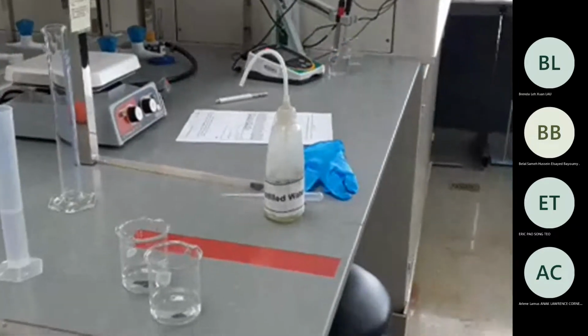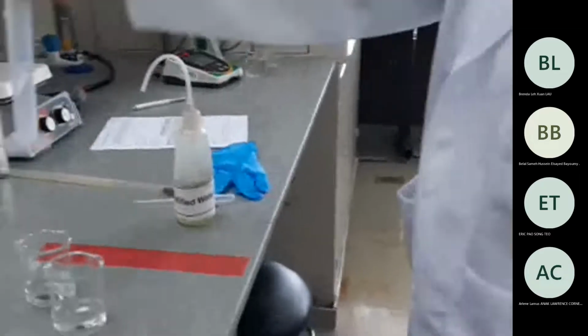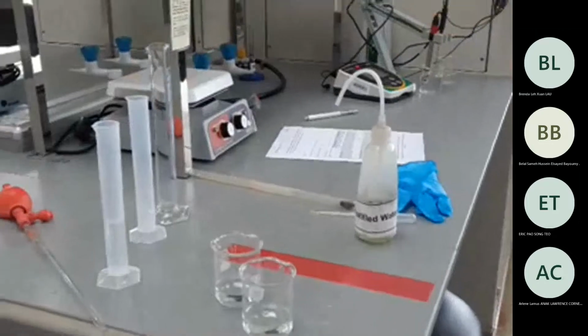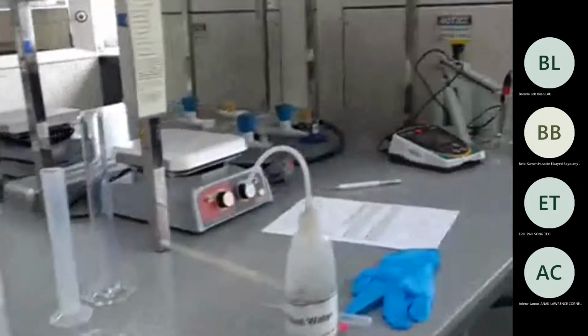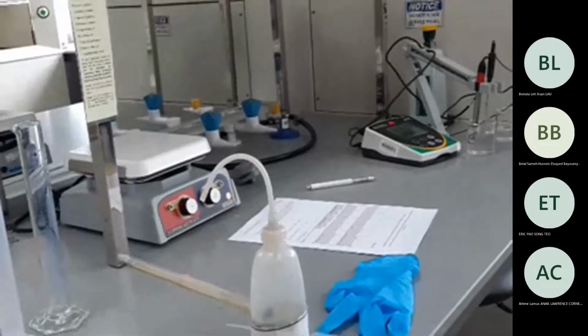Take the same measuring cylinder for measuring the water. Don't take a different measuring cylinder. These 2 already. Another 2 you need.